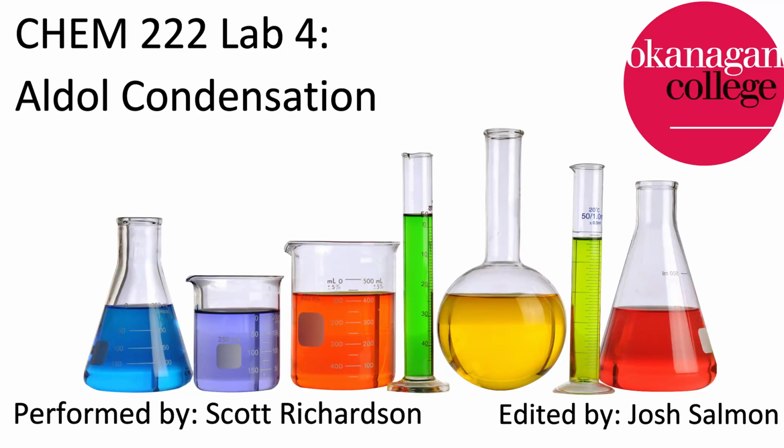Okay, welcome to Lab 4, the Aldol Condensation, the last virtual lab of Chemistry 222. We chose this lab as a virtual lab as there's not a lot of new experimental techniques learned. There is a recrystallization that is done, and we do use a centrifuge to isolate some extremely fine particulate matter. However, this experiment is more important because of the mechanism and the underlying theory that controls this experiment.